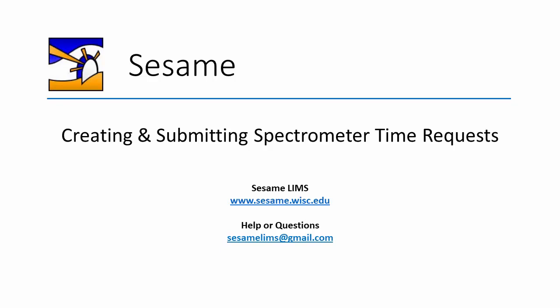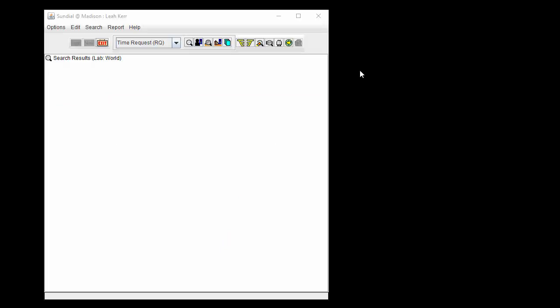Hello and welcome to this video tutorial about creating and submitting time requests for spectrometers in Sesame. In this tutorial, we will be working in the sundial module.